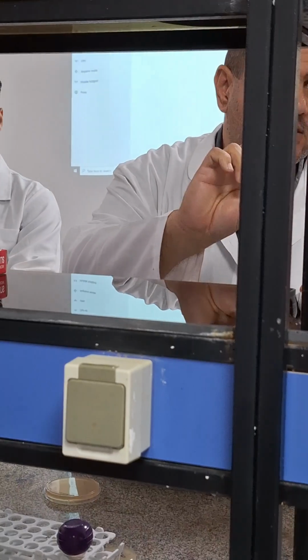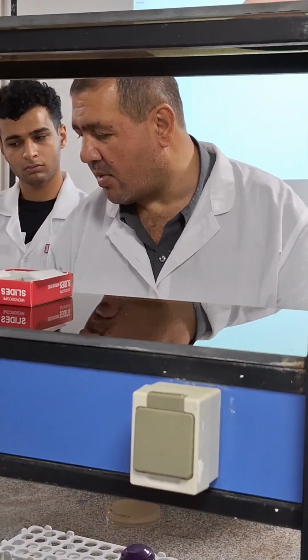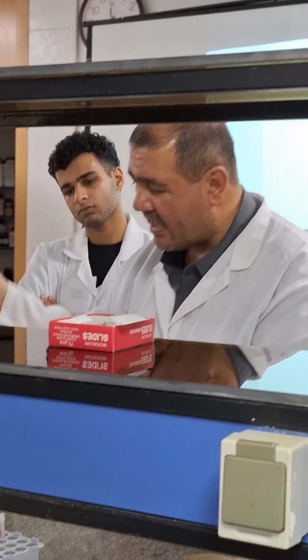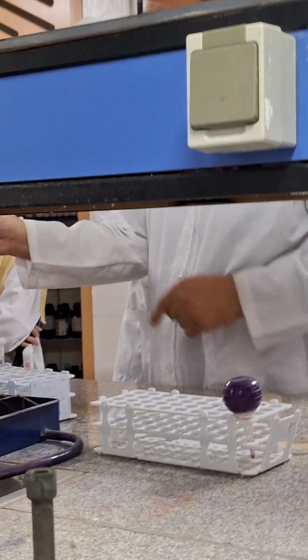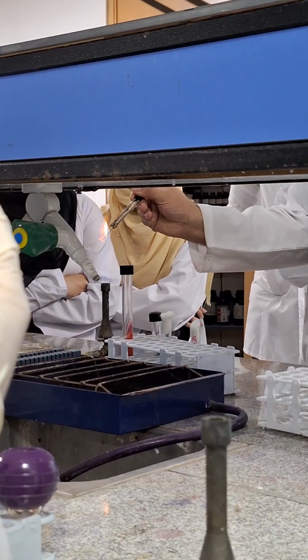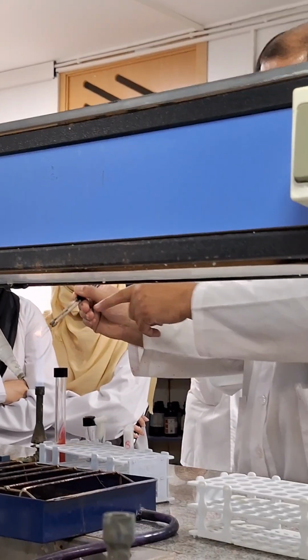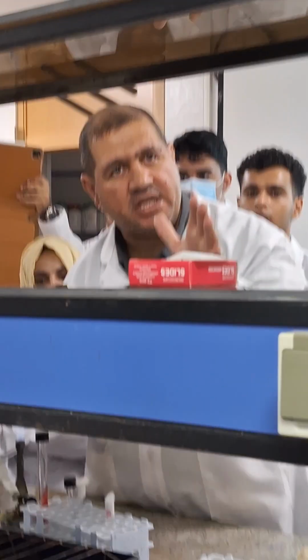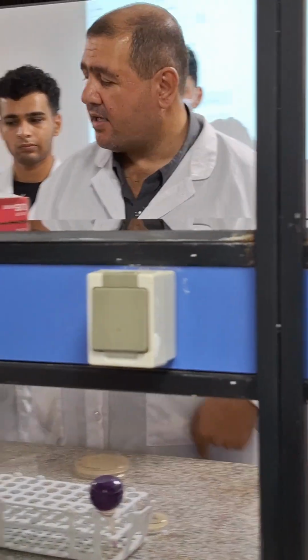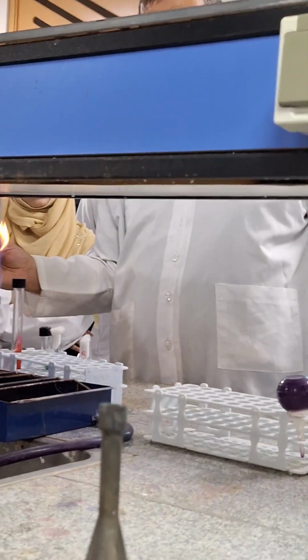You must sterilize your loop and needle before and after culture, by flaming. Take your loop and needle, hold it in the flame over the top of the plate until the color of the needle changes. Needle and loop. After that, you must wait for air cooling, 10 seconds, because heating kills your bacteria. Don't wait for cooling on your plate. Wait 10 seconds for cooling.